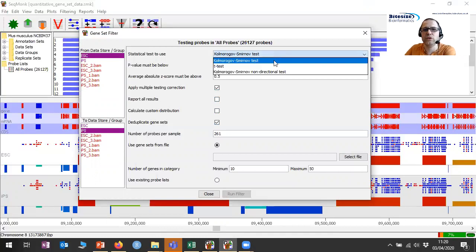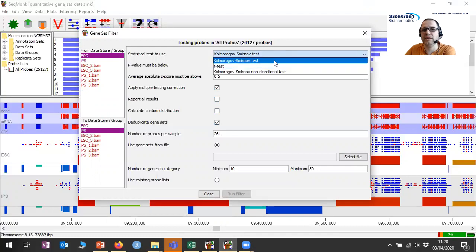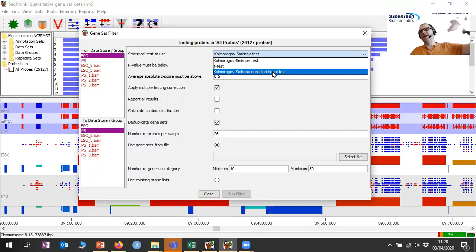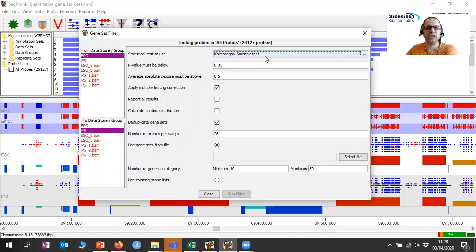We then get to pick which test we want to use — this relates back to what I showed in the graph about what kind of expectation we have for the things that are different. We could do a t-test. The default is the Kolmogorov-Smirnov test, which is what I'm going to use. We could also do the non-directional Kolmogorov-Smirnov if we were looking for things that maybe were disrupted in both ways. This should give us a directional change but without the expectation of an equal amount of change.